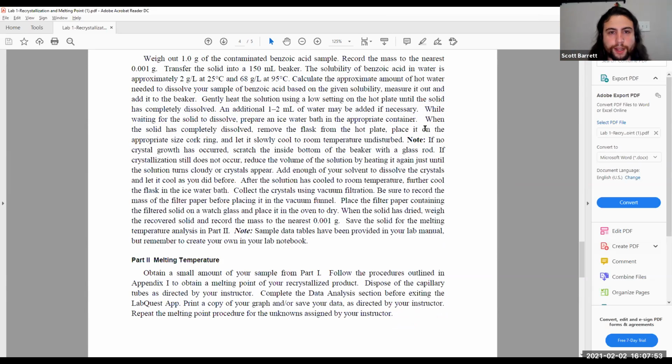So we go forward, then after it's cooled to room temperature, we put it into the ice water bath, and that's where the real precipitation would start occurring. You pretty much go to the maximum amount of precipitation.